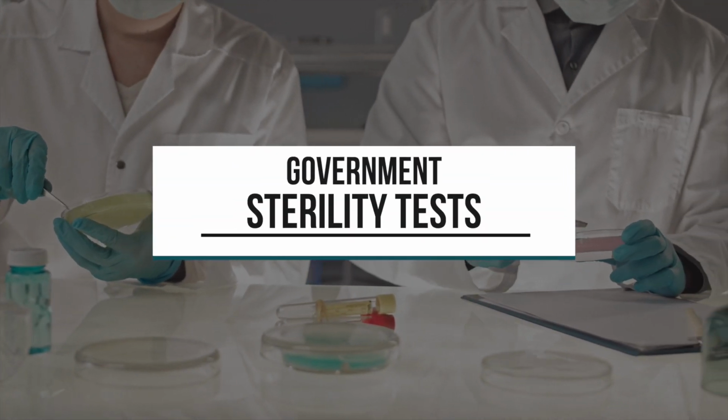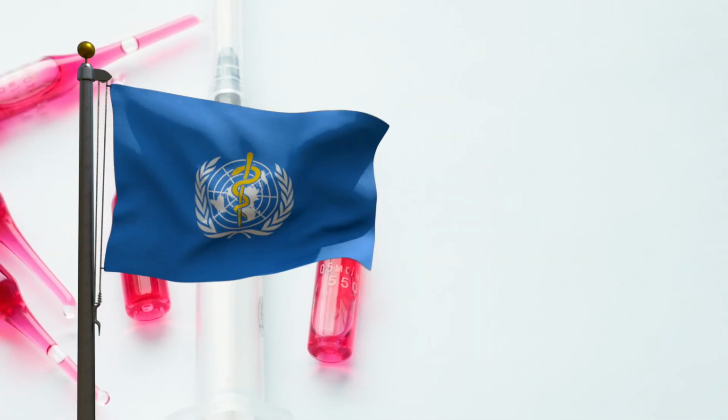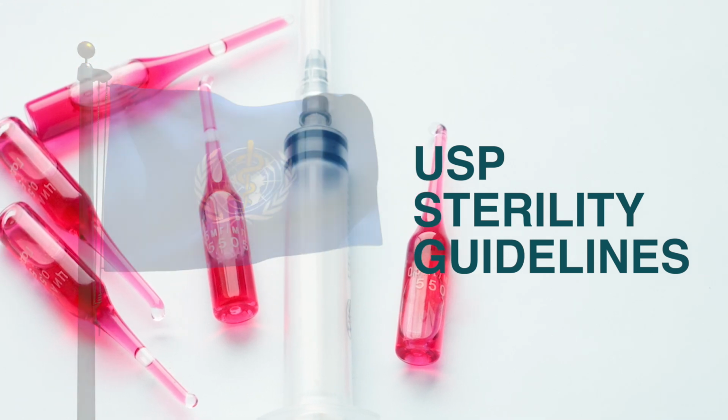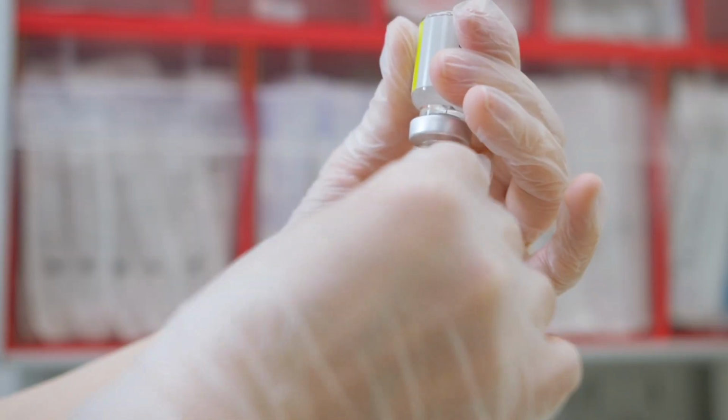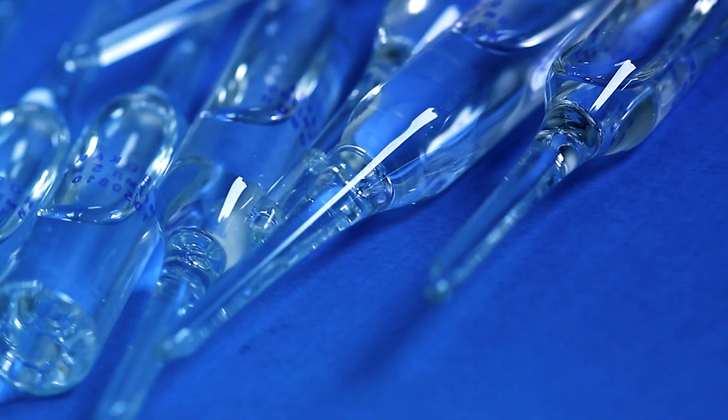The primary purpose of government sterility tests is to prevent the contamination of medical products. According to the World Health Organization, USP sterility guidelines help regulate a wide range of biological medicinal products, specifically in vaccines, blood products, biotechnology products, and cell and tissue products.